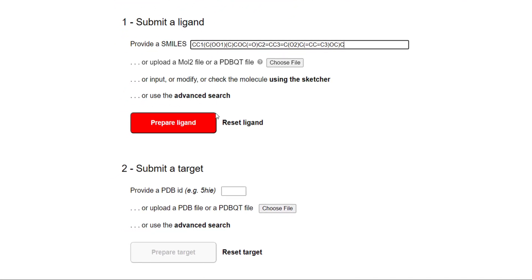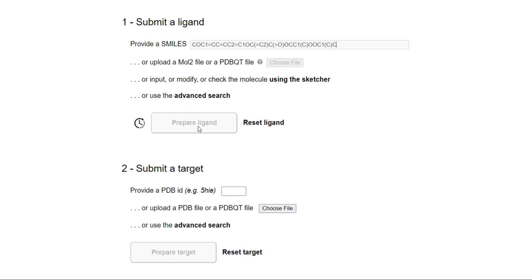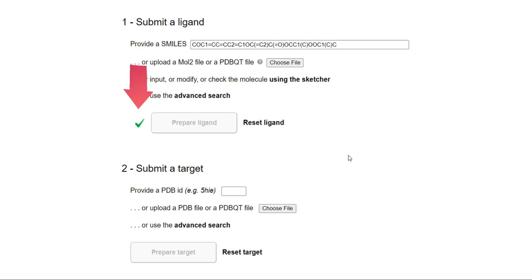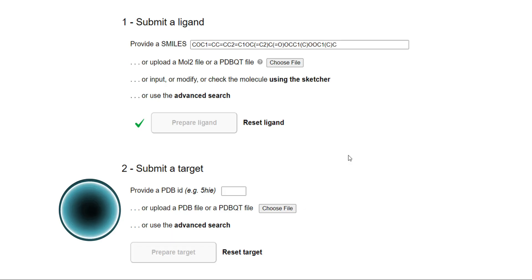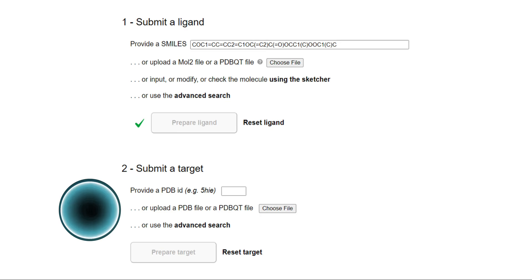So let's copy the SMILES from PubChem and paste them into the SwissDock SMILES option. Once you do that, you will notice that the 'Prepare Ligand' button is now highlighted. Click on it — this may take some time — and when your 3D structure of the ligand is prepared, you will see a green tick sign appear. After uploading your ligand, it is now time to upload the 3D structure of the protein.